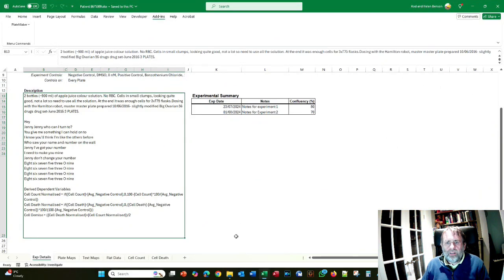Now the final thing I want to show you is the experimental register. So if you remembered, at the very beginning I selected to save this file we built into the experimental register, and you're now going to see the experimental register and how it works.